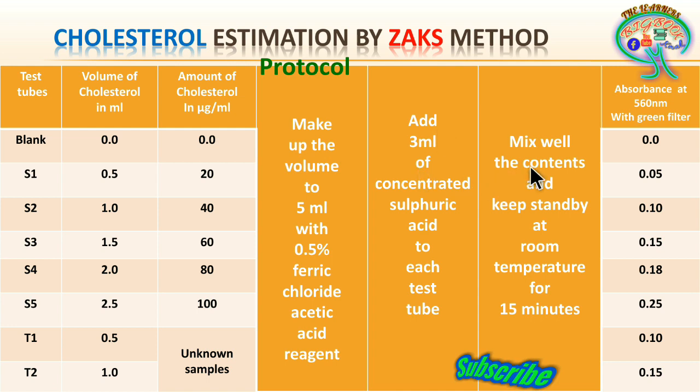Now after that we are going to mix the contents well, and we are going to keep the contents on standby at room temperature for 15 minutes so that the reaction can complete on its own. After that we are going to estimate the absorbance at 560 nanometer with a green filter.